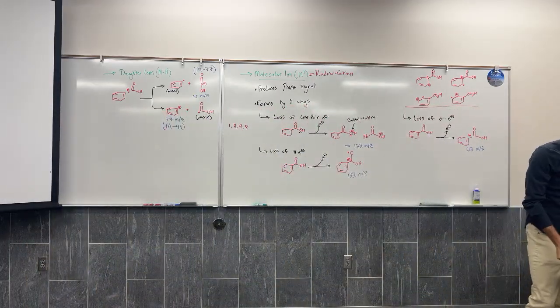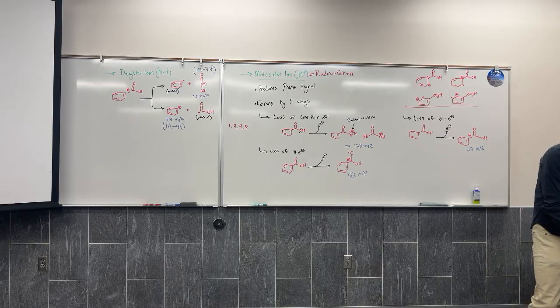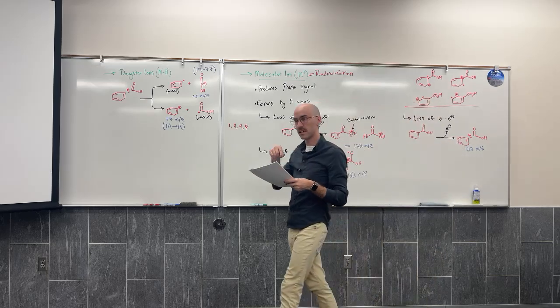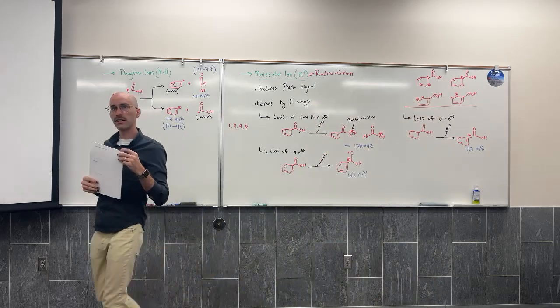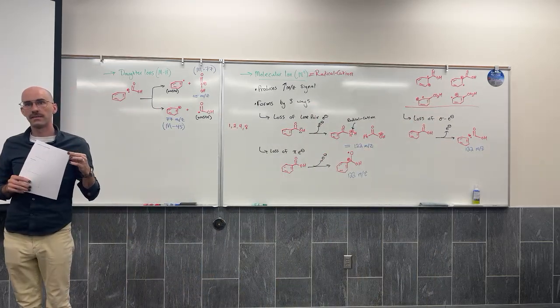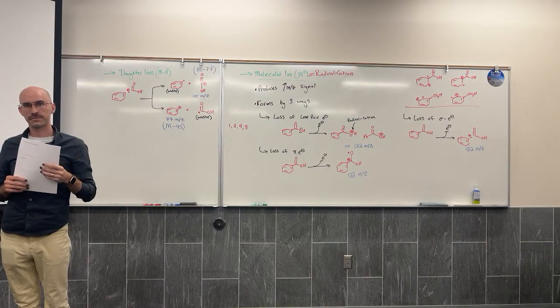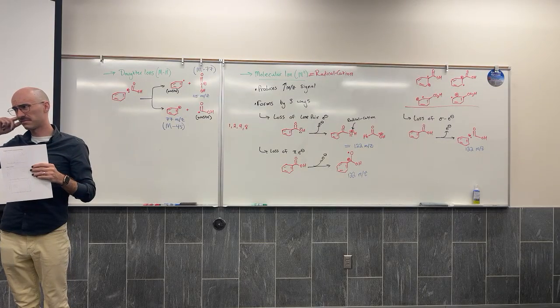All right, I do want to point out that the molecular ion of benzoic acid, 122 to 106, that's a loss of 18. What, 122 to 106?